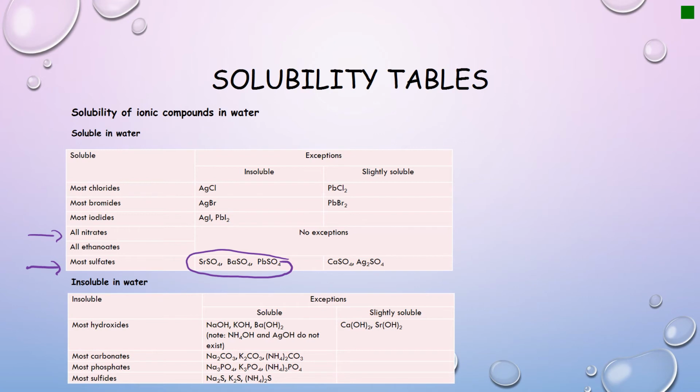I want to make, for example, a barium precipitate. So I'm going to say I want to make barium sulfate. Now if I want to make barium sulfate, when I add barium something to both test tubes, my copper sulfate is going to provide the sulfate ions to make the barium sulfate. I obviously need a barium ion to make the barium sulfate, but the barium ion has to come with something. So it has to be a soluble barium ion. Now I always like to use a nitrate because every single nitrate in the entire wide world is soluble.